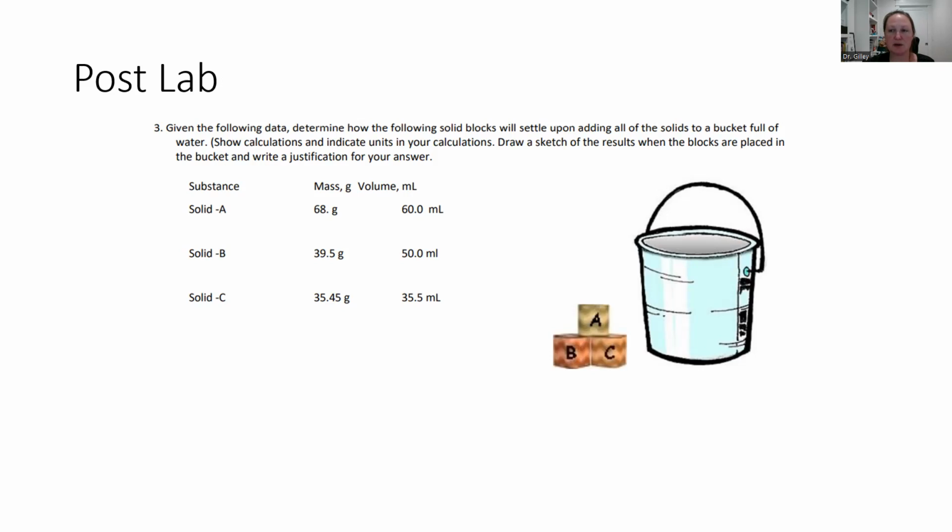And then don't forget to report your density to the correct number of significant figures and place a box over that. If you don't know how to report to the correct number of significant figures, or you're really still confused about that, I really encourage you to try to come to office hours. I know you're at work, but maybe you can take a 5-minute break just to come in, and I can help you with anything that you're struggling with, or send an email so that I can help you as well. All right, so that is the end of this, and good luck with your experiment.